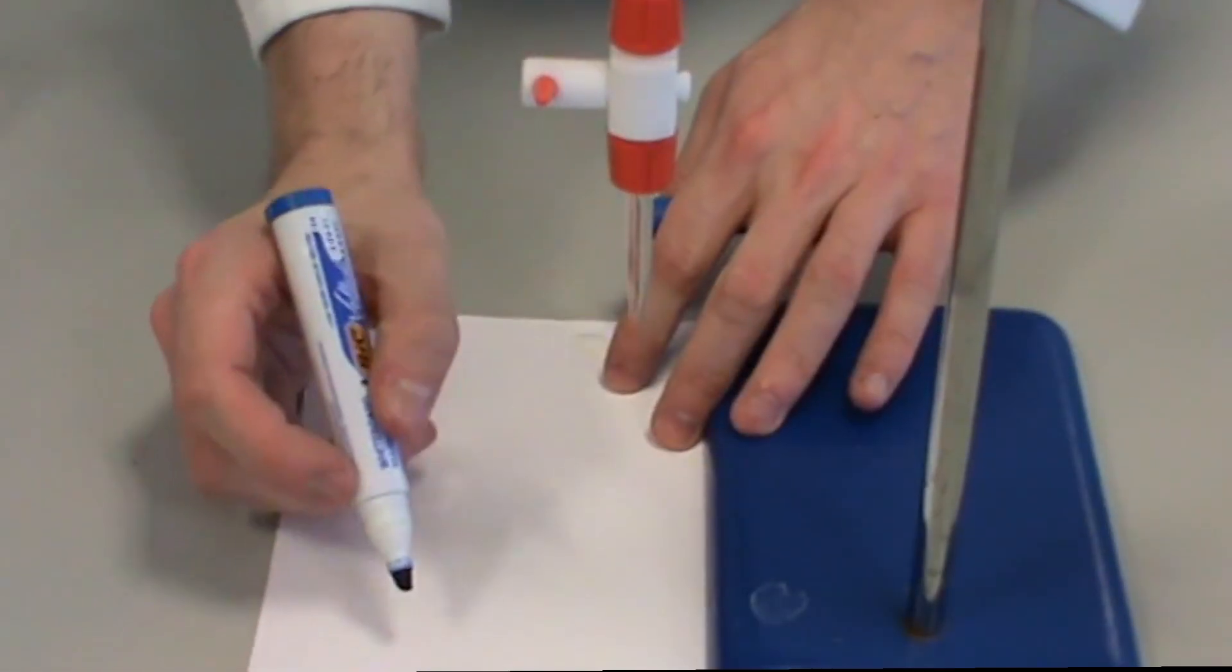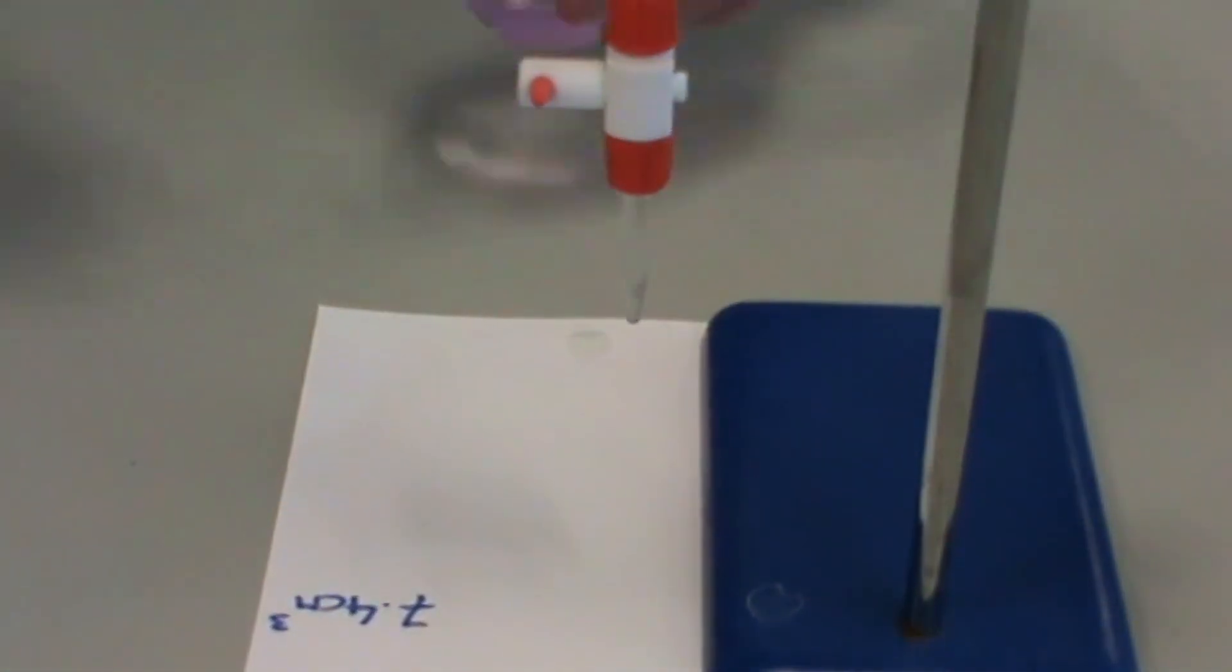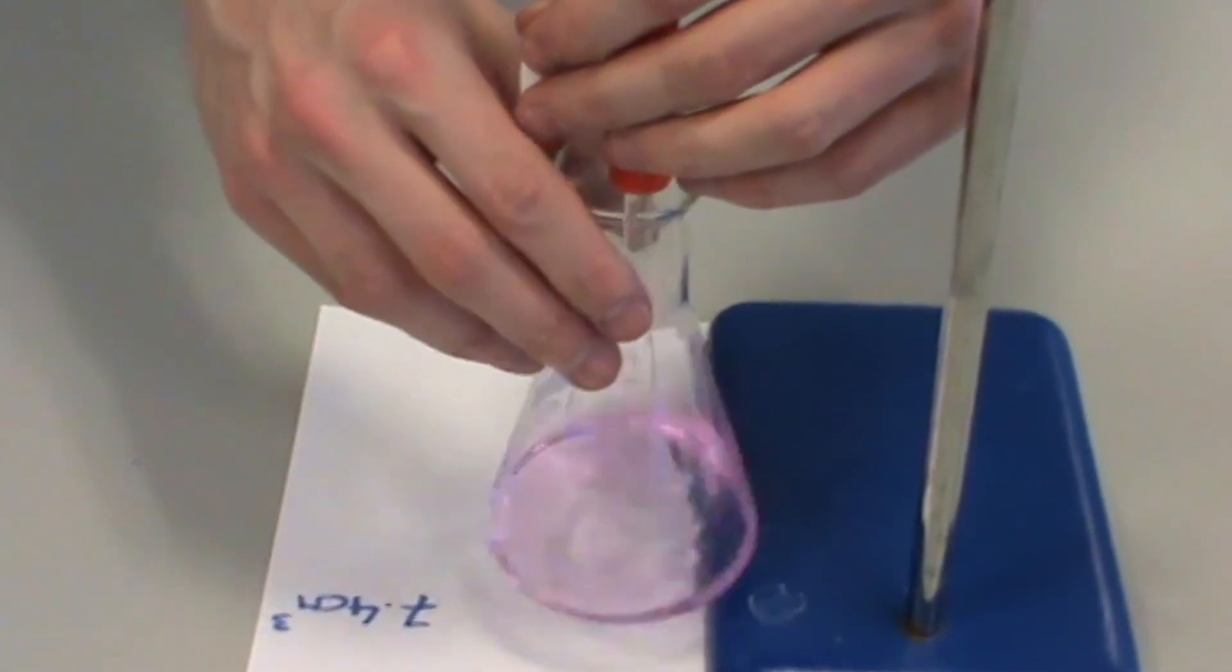A piece of white paper or a white tile is placed below the burette. This will allow you to more easily observe when a colour change occurs. The starting volume on the burette is recorded.